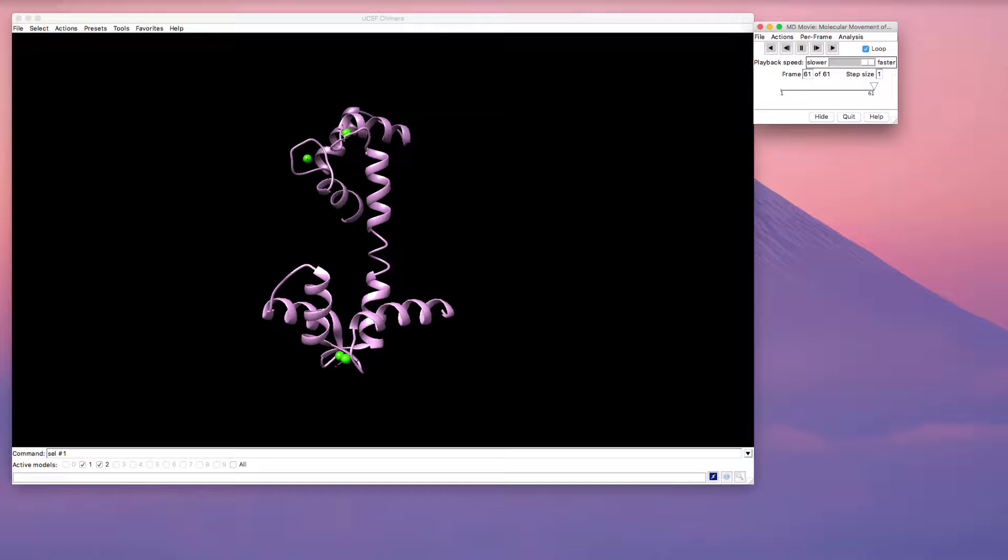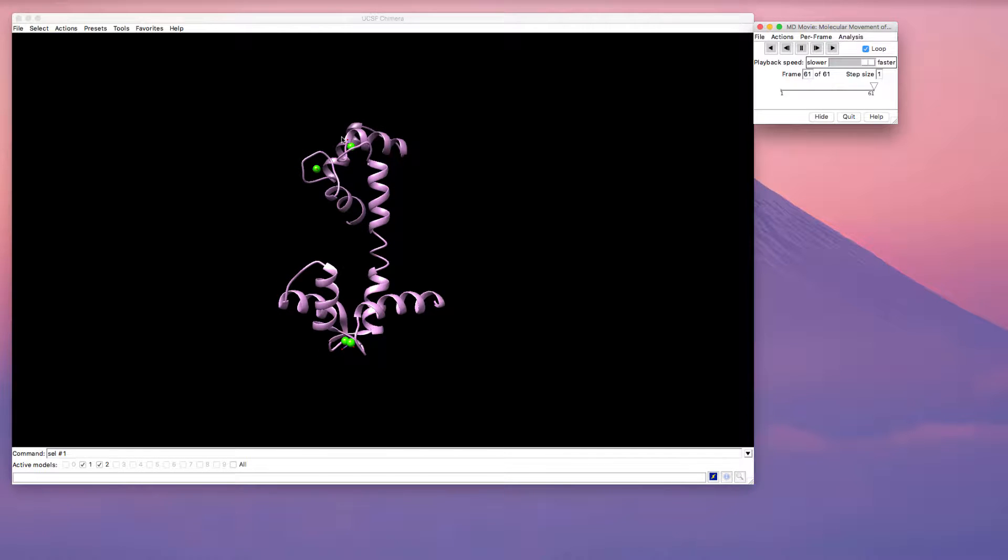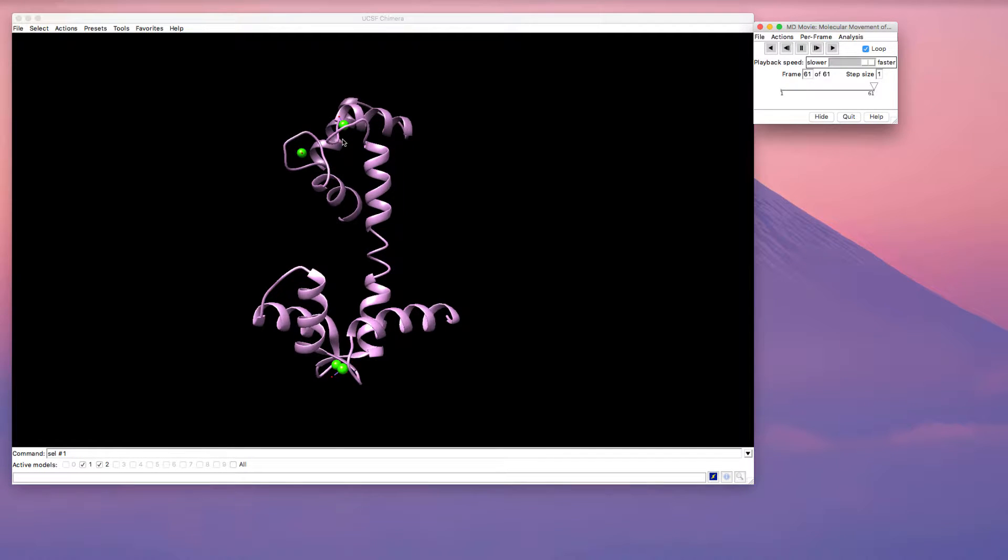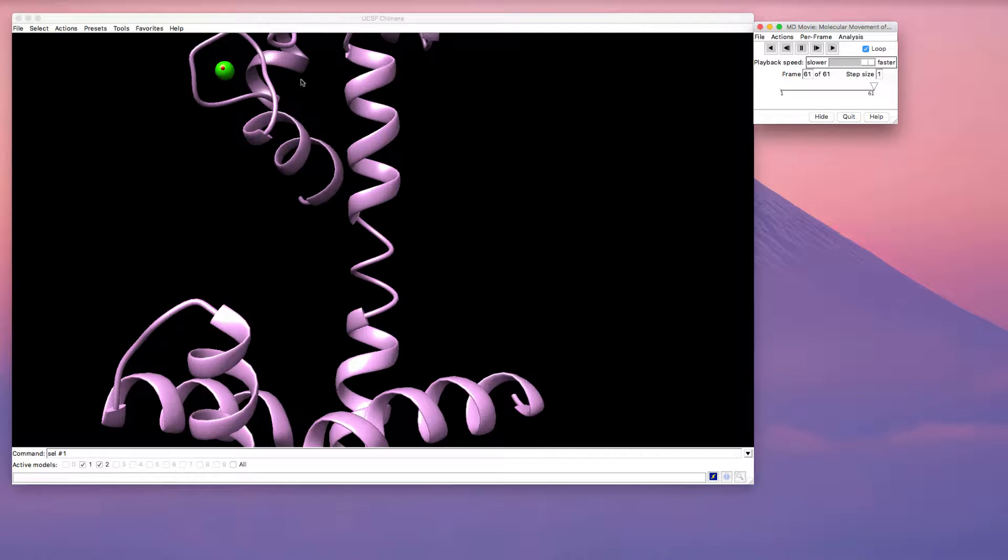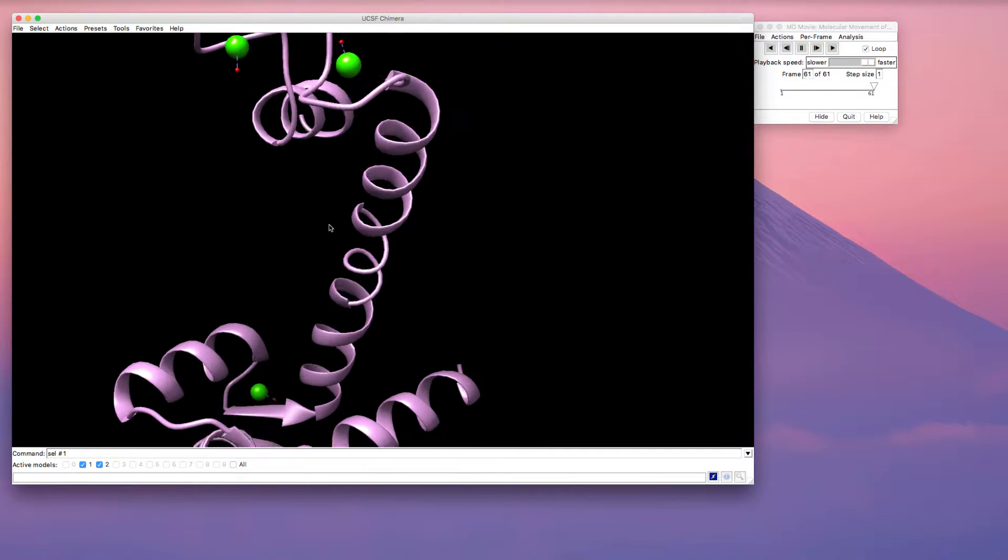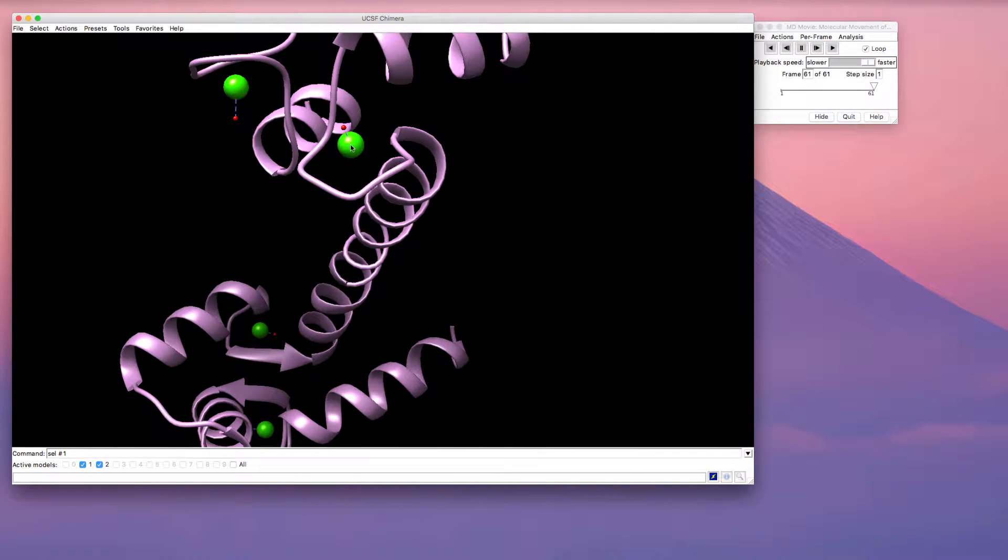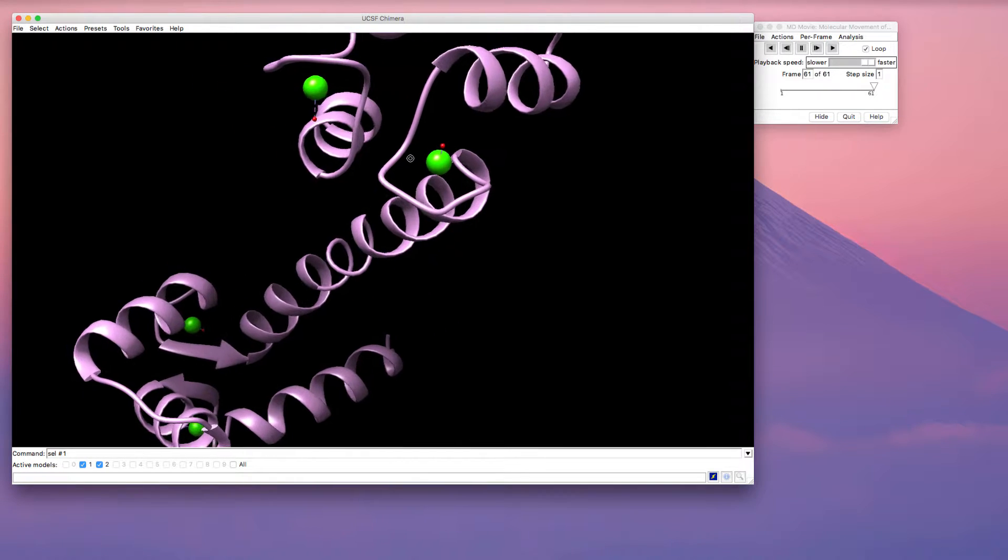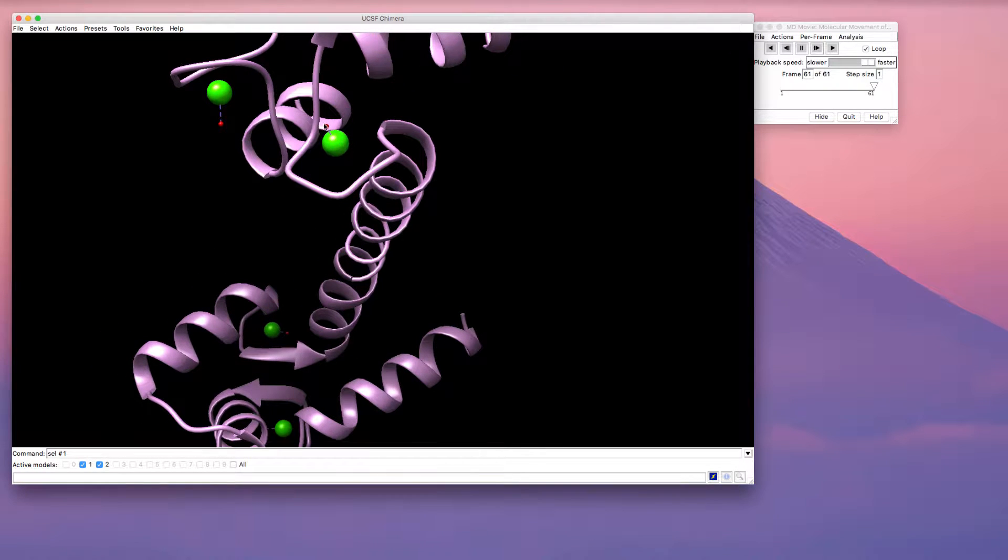So here I have, if I zoom in here, I can see that I have water bound to my calcium ions, but it only shows the oxygen atom.